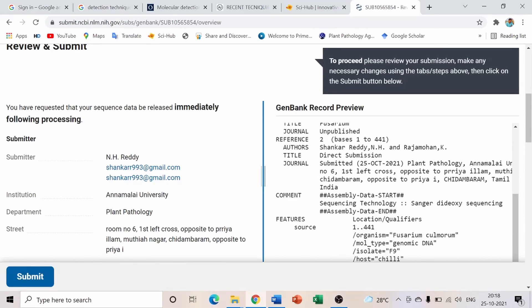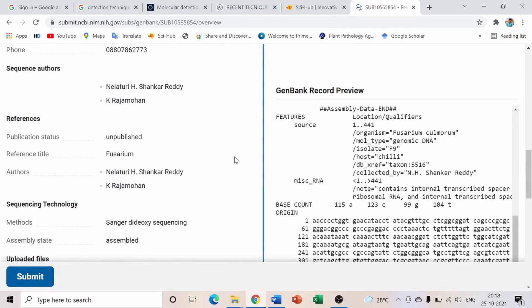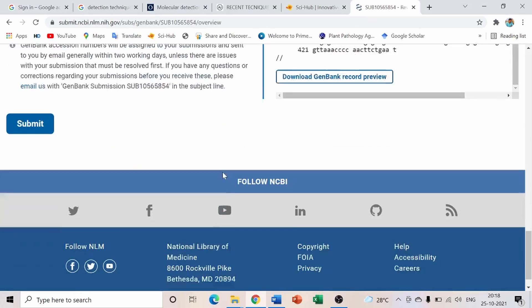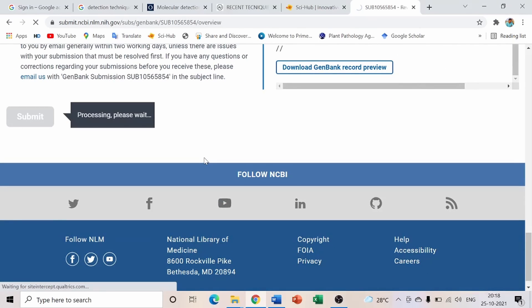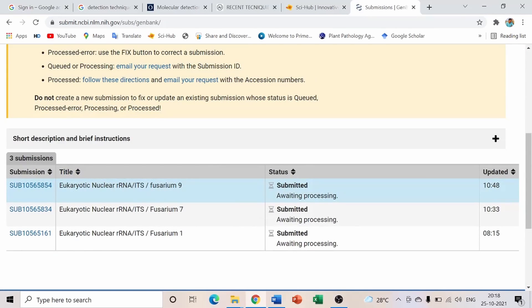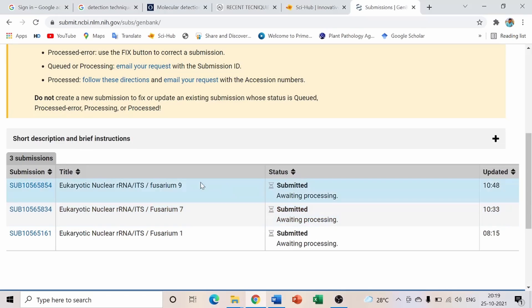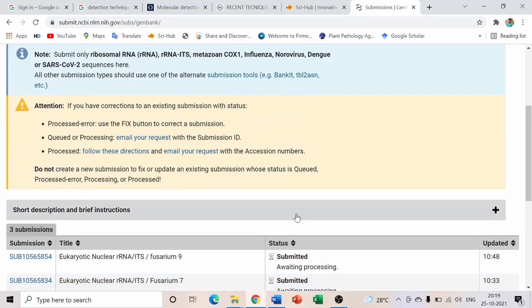Finally, the Review page shows everything you submitted — F9 isolate, ITS1, source organism Fusarium culmorum, and reference details. Check for any mistakes; you can go back and edit. Once everything looks correct, click Submit. The submission will show as 'Awaiting Processing,' which takes about two to three days to appear fully in GenBank. You will receive a submission number like SUB10565854.